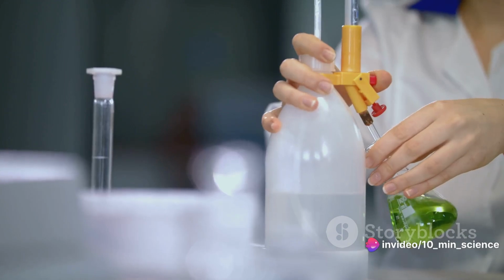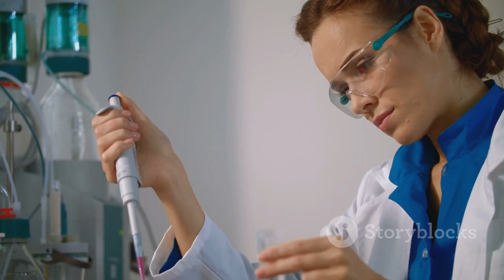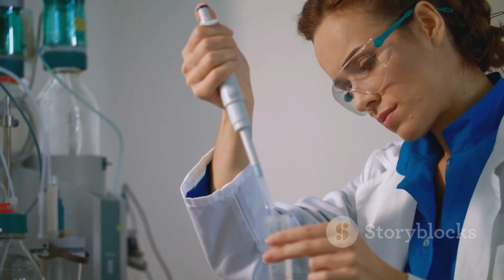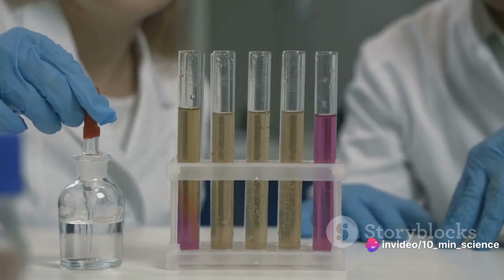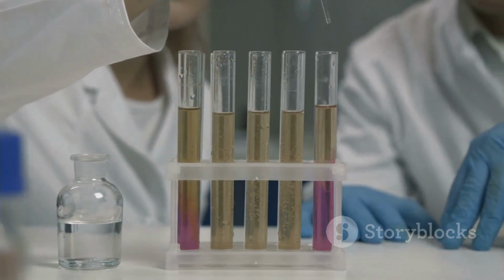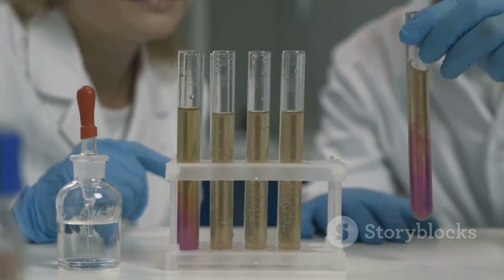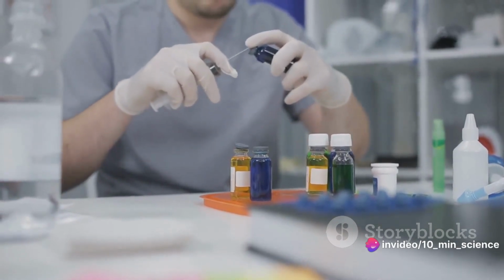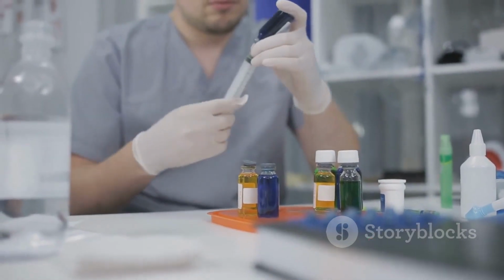Each reagent has its own unique properties such as polarity, acidity, or basicity, which can influence how it interacts with the compounds in the sample. This, in turn, can affect the separation and detection of these compounds. For instance, a highly polar reagent might cause polar compounds in the sample to elute more slowly from the column, while a less polar reagent might cause these compounds to elute more quickly. This means that the choice of reagent can directly impact the resolution of the chromatography, or how well we can distinguish between different compounds in the sample.